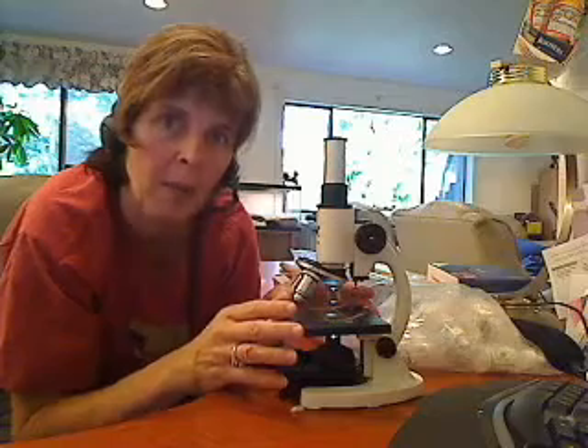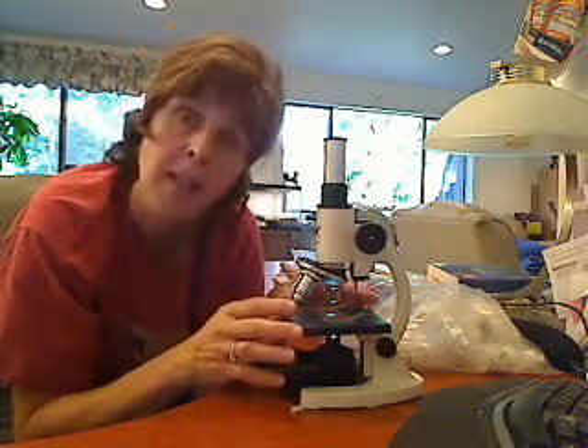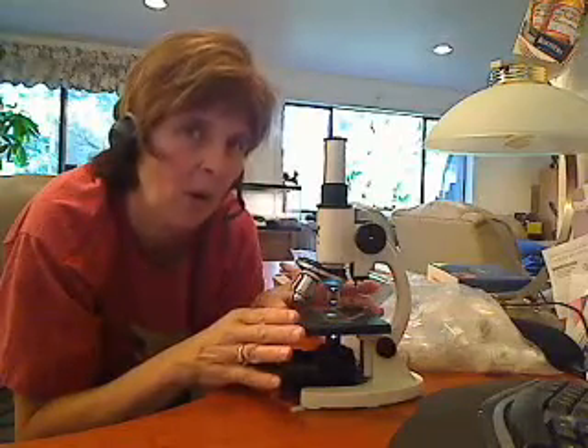The first early microscope was made by a man by the name of Hooke. He named cells, which means 'little rooms' in Latin. The next man, by the name of Leeuwenhoek, a few years later, came up with a microscope that would have magnified about as much as you're going to be able to see on the highest power on this one.